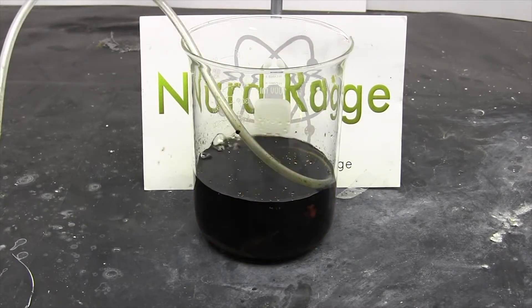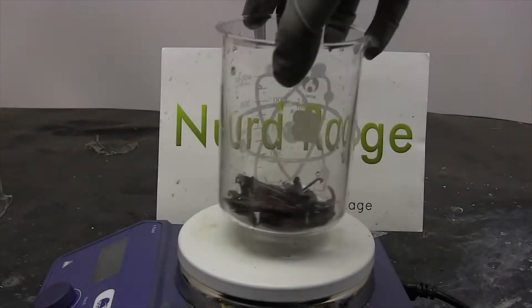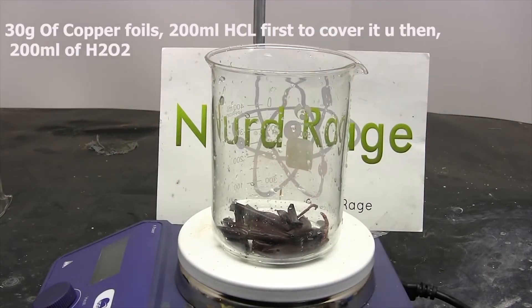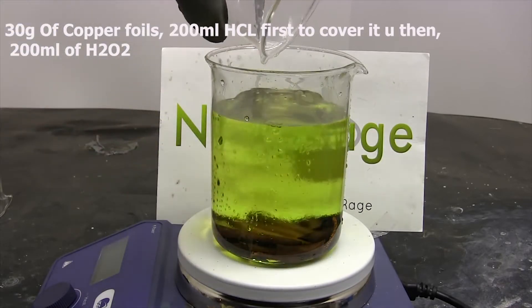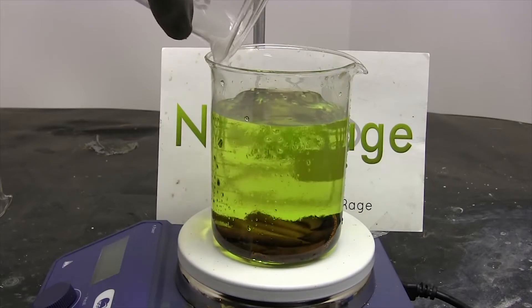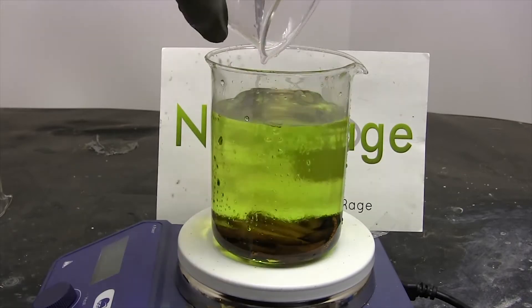Now let me show you another way. For the second method, take 30 grams of copper foils, then add 200 milliliters of hydrochloric acid to cover the copper foils. After that, add the same volume — 200 milliliters — of hydrogen peroxide on top. This is going to result in the formation of copper chloride and water.